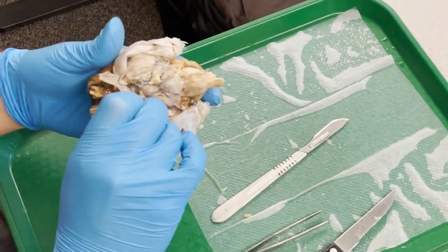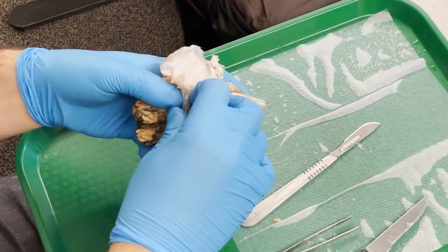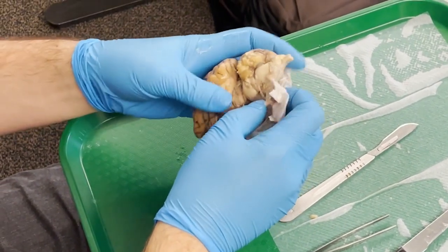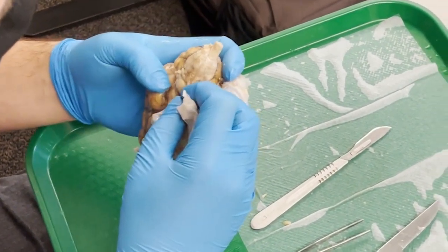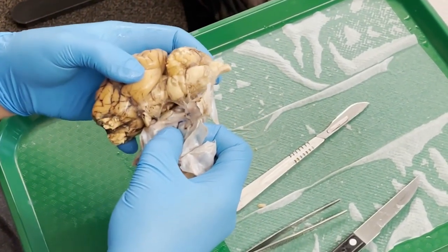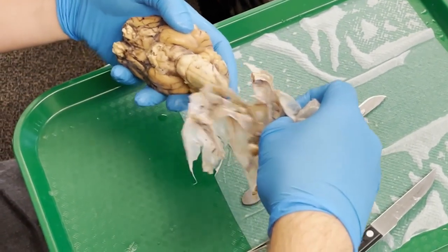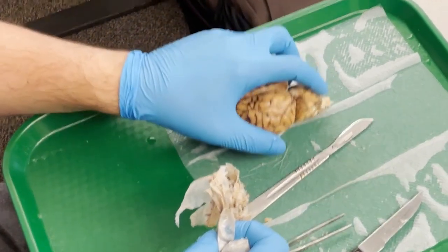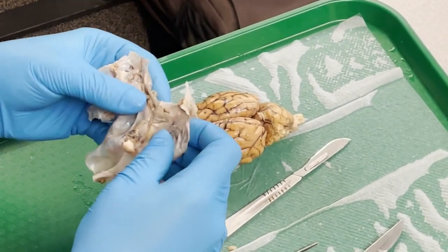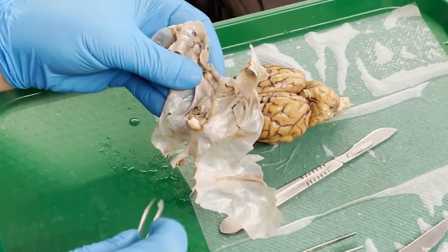Other things I think should stay on, but for now I'm going to carefully try to peel this back and remove it. There may be some cranial nerves sticking through, like I suspect. Yes, I will just yank that off carefully. And now we have our revealed brain. If we look at the inside of the dura, you will see sort of membranous tissue here.